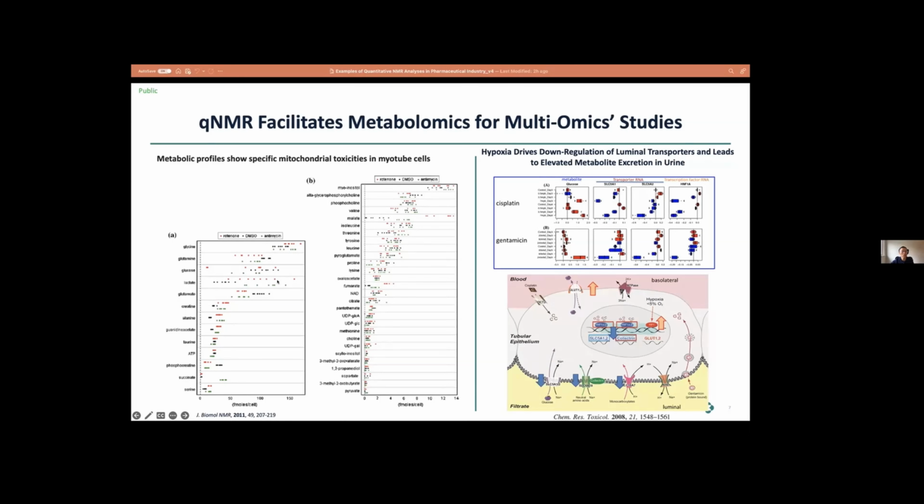For example, the lactate will increase in the red. You can see those in the presence of the mitochondrial toxicants, in this case rotenone, red, and antimycin, green, compared to the vehicle control. So this just illustrates all the metabolites we can list. Some of those are representative here, and we can look into the metabolites to understand what kind of toxicity, and what kind of detailed mitochondrial complex inhibitions.